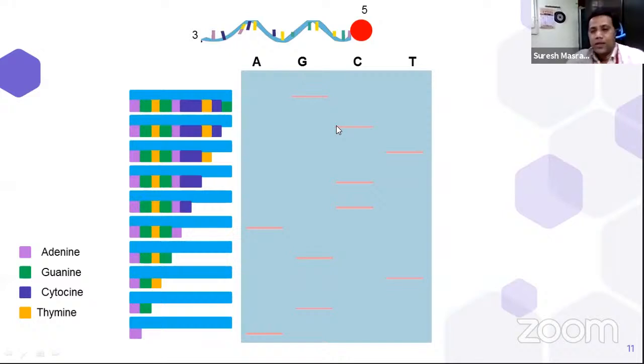Thus, each strand now has an entire 10 base pair long single stranded DNA. Along with it, there is a newly formed strand of DNA which is formed in the course of replication. Thus, all the DNA fragments have at least the 10 base pair single stranded DNA which we put there.